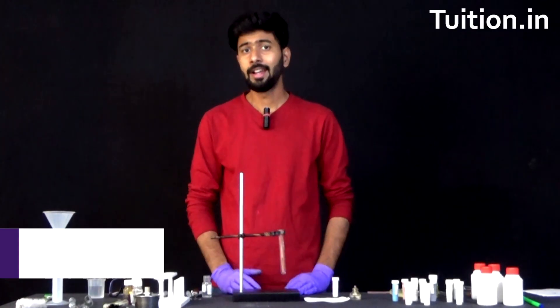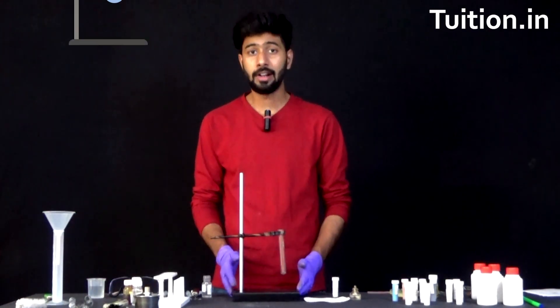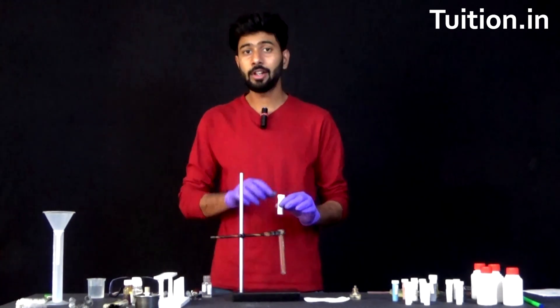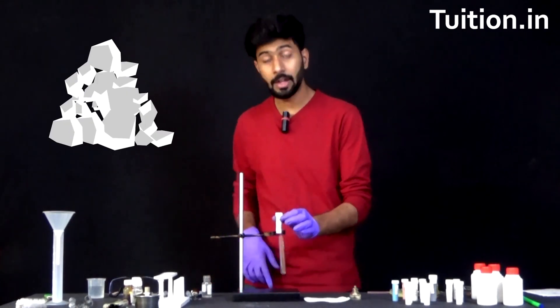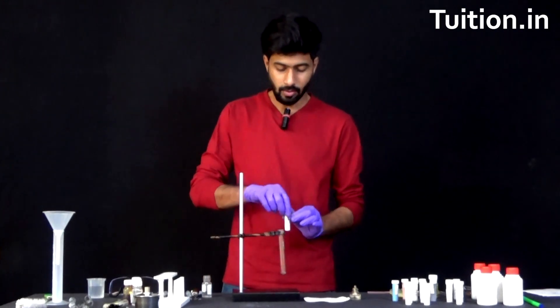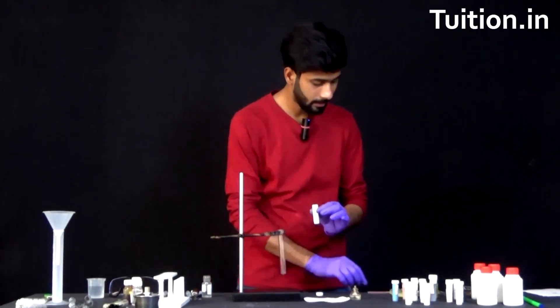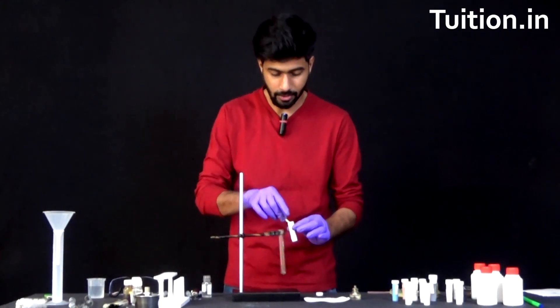Before we begin, let us see what all we would require in order to carry out this experiment. We would require a dry test tube mounted on a stand. The major ingredient of this experiment is the ammonium chloride salt. We are going to burn this salt and produce two gases out of it. Take about 5 grams of ammonium chloride and put it in the test tube.